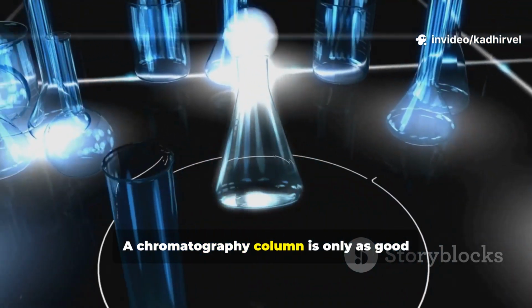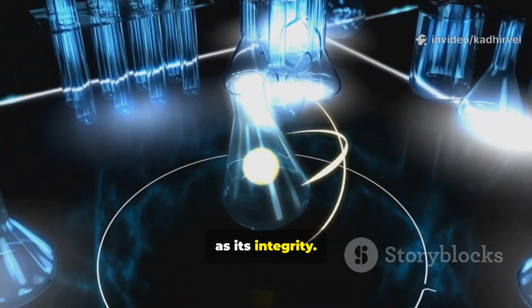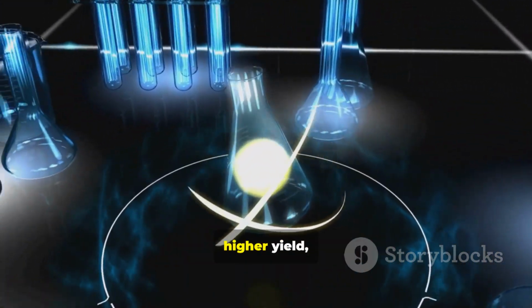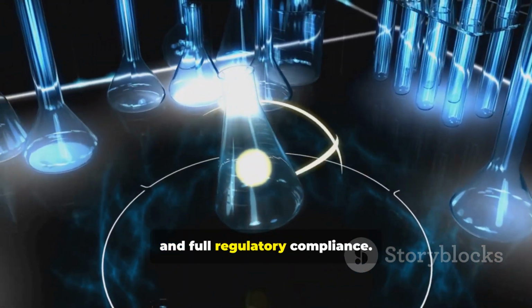A chromatography column is only as good as its integrity. A strong integrity program ensures consistent purification, higher yield, and full regulatory compliance.